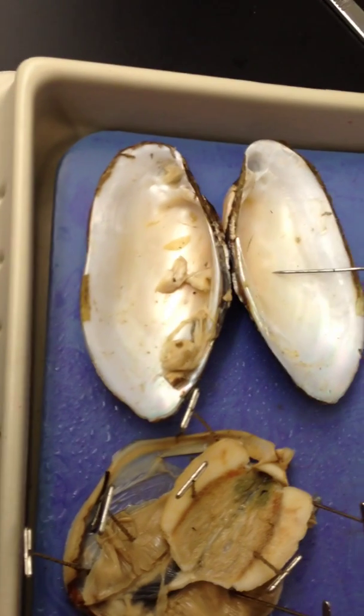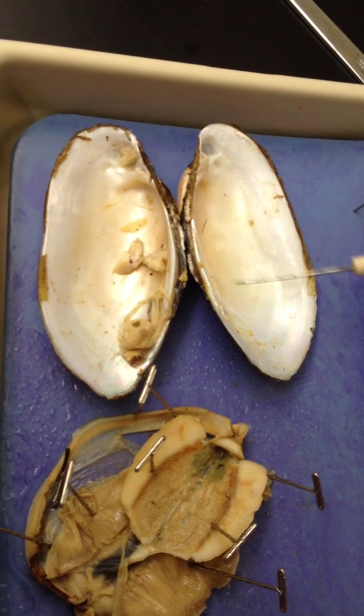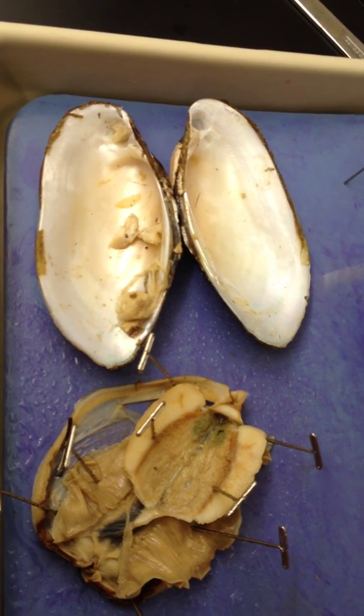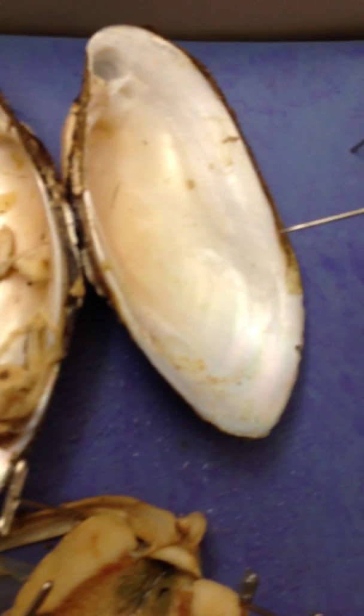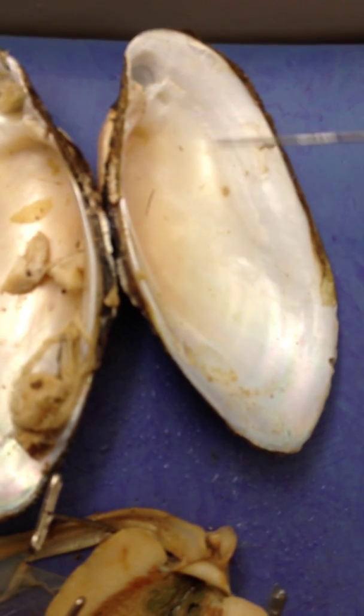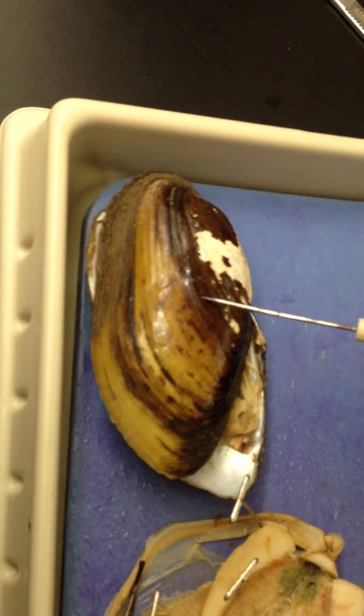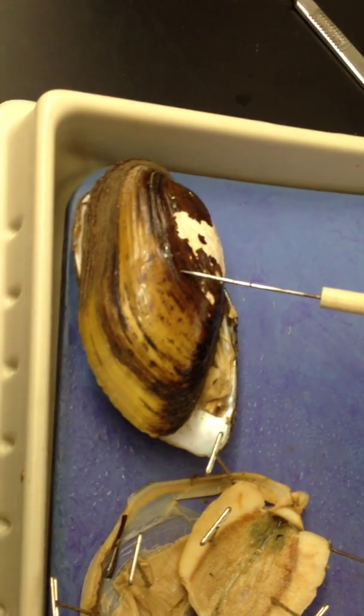This is a shell. This internal surface is called the nacre, N-A-C-R-E. This layer right here is the nacreous layer. The color that you can see is shining through the clear nacreous layer from the prismatic layer. The outside layer is the periostracum.